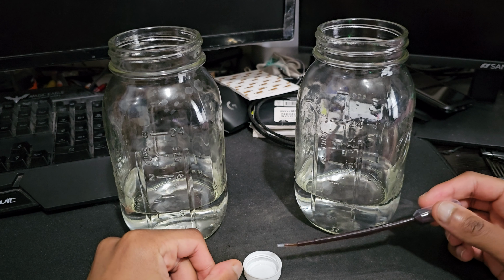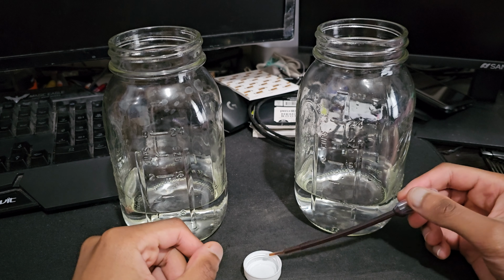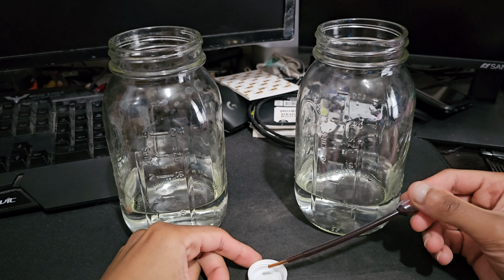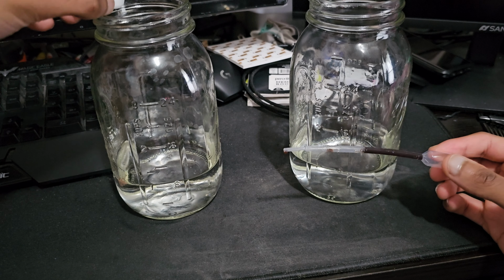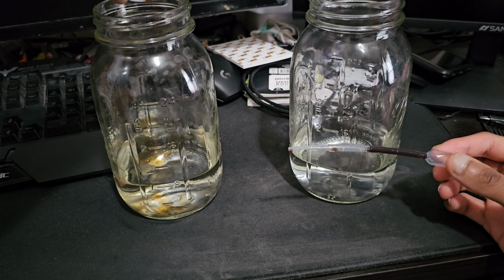And I'm wondering if I should put some milk in these like I did for the other experiment. I'm not sure if it made much difference. I think my thought was maybe the bacteria in it would feed some of the microbes. So maybe I'll grab a little bit. There's some milk I need to throw out anyway, so should I go like that bottom layer? Let's see how much that does. A little left in there.